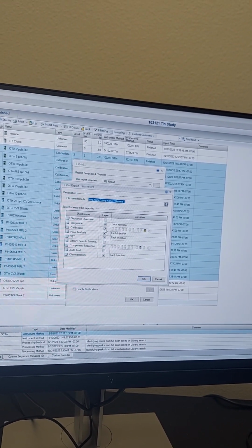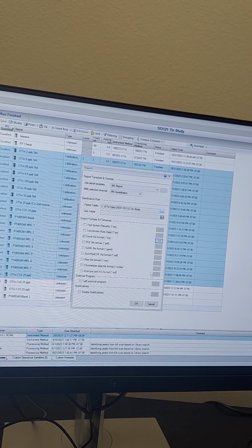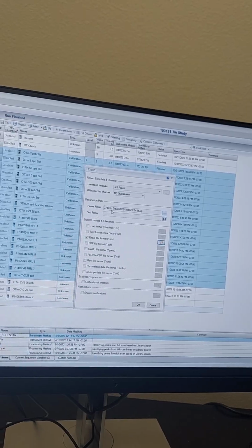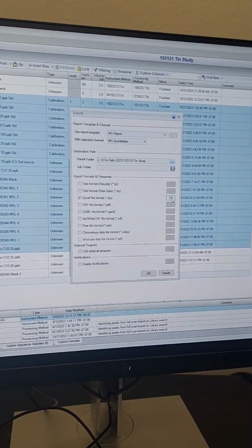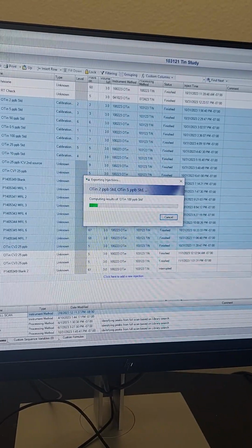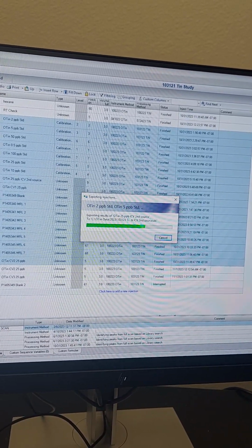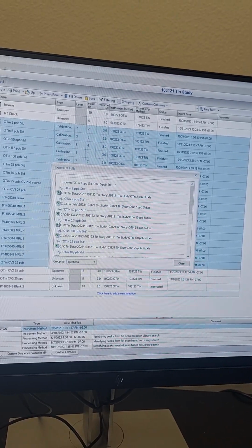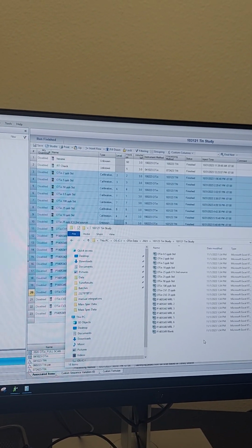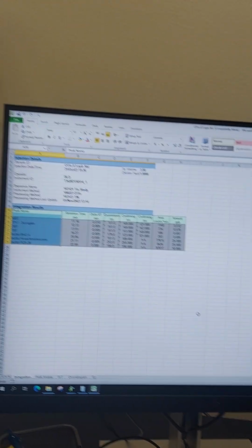Okay. So MS report. Make sure that's MS quantitation, and then just select the file. You don't need to change. It's already set. I believe that should do it. Yeah, it should. Yeah. Yep. Yeah, exactly. Okay. That's what you need.